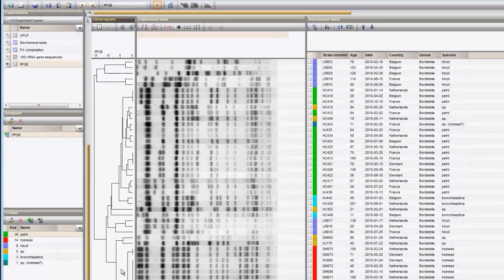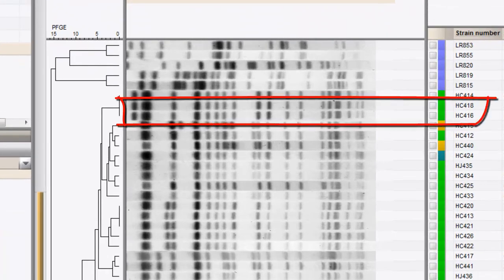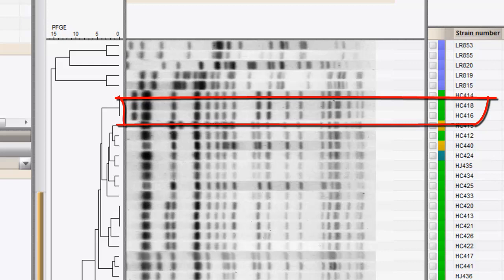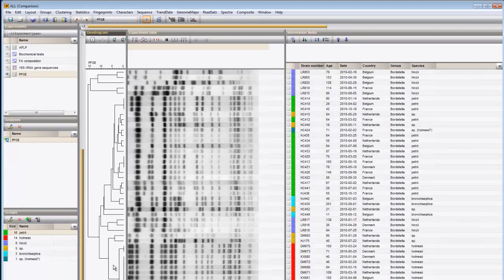For example, HC416 and HC418 look identical, but apparently have one mismatch. I will select these two entries so that we can easily locate them.